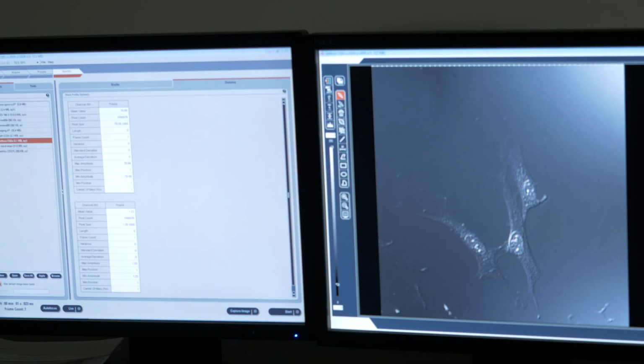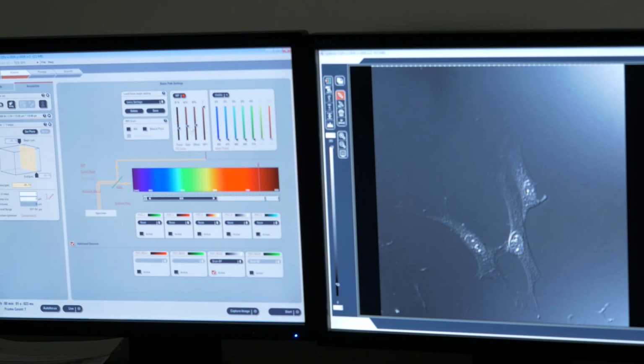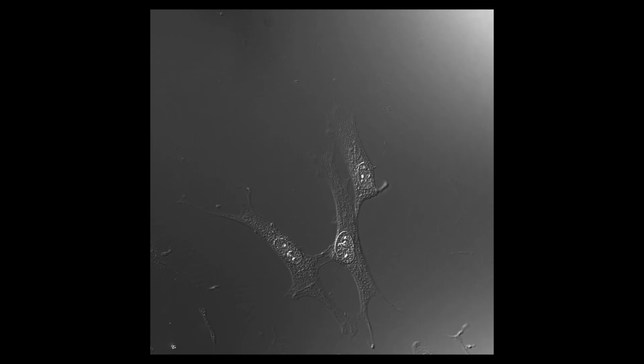Bright field microscopy is the simplest of all optical microscopy illumination techniques. Bright field microscopy relies on the differences in absorption of light due to the differences in densities between various parts of the sample, which for our purposes is a cell. Because of this, bright field microscopy is not great when you want to see your cell in detail.